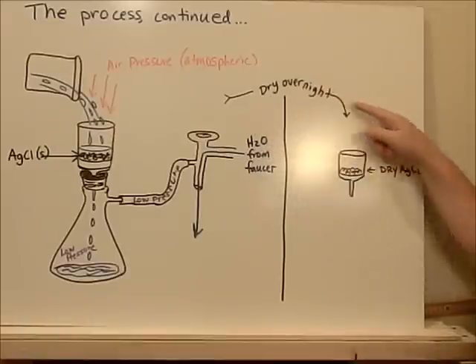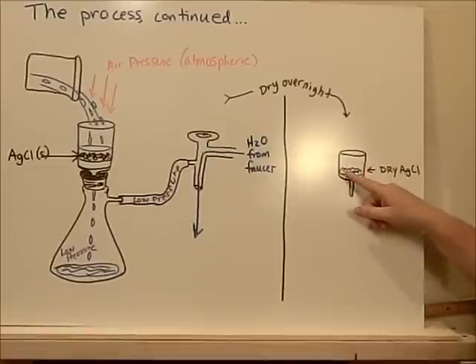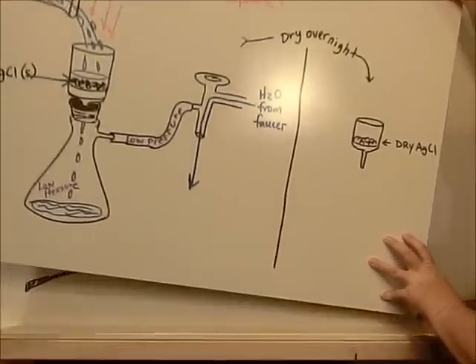We're gonna dry it overnight, and then we're gonna weigh it in the morning. And from the weight of the Gooch plus the AgCl, you're going to subtract and get just the weight of the AgCl. You still don't need to write anything yet. This is just for your background.